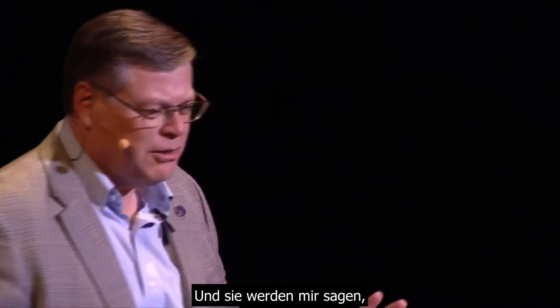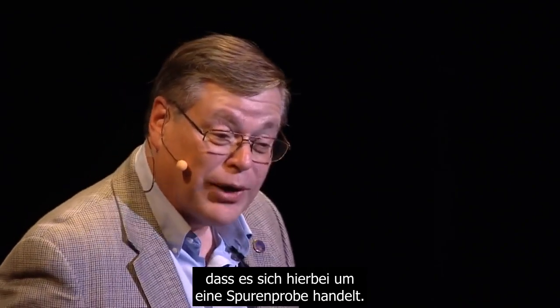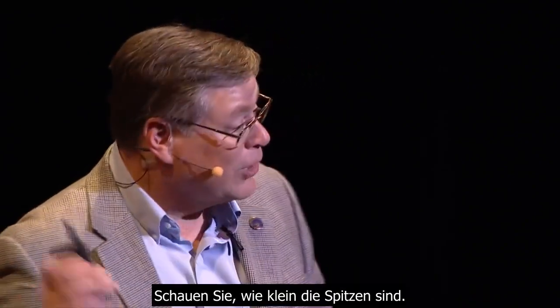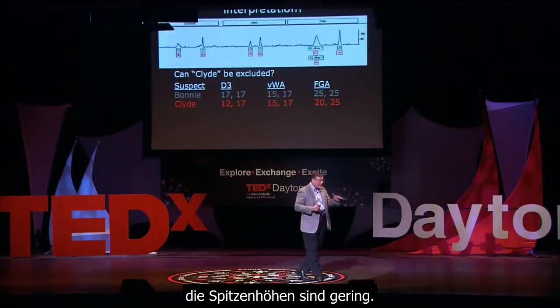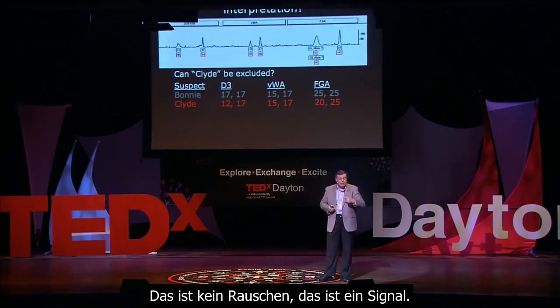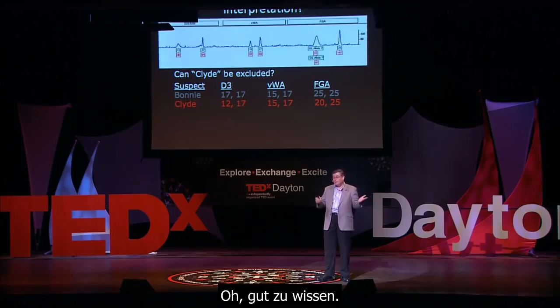And they'll tell me, you apparently are neglecting the fact that this is a trace evidence sample. There was very little DNA to work with. Look how small the peaks are. When you're dealing with small amounts of DNA, the peak heights are small. Sometimes they're misshapen. That's not noise, that's signal. That 12 is real.